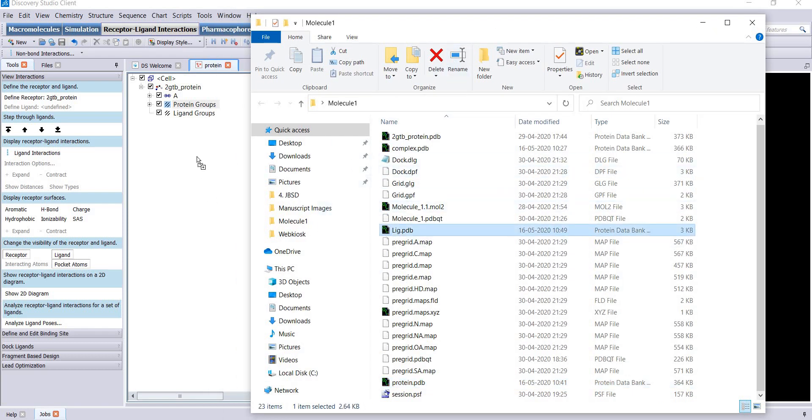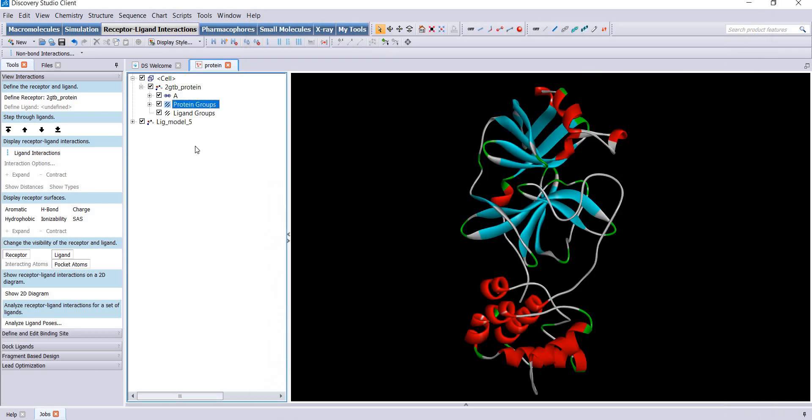Drag this ligand file directly into this hierarchy window. You can see this model appears here. I will center this model and now you have this complex of protein and ligand.